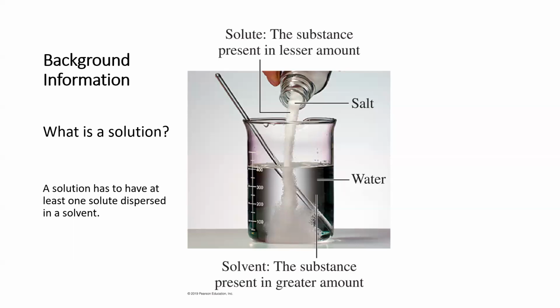And some people think, well, the salt then went to a liquid phase, right? Maybe it melted into a liquid, but that's not the case. The salt is not going to a liquid phase when it dissolves in water. Instead, it's becoming dispersed in the water as separate sodium ions and chloride ions. And once it's in there, we call the entire thing a solution.